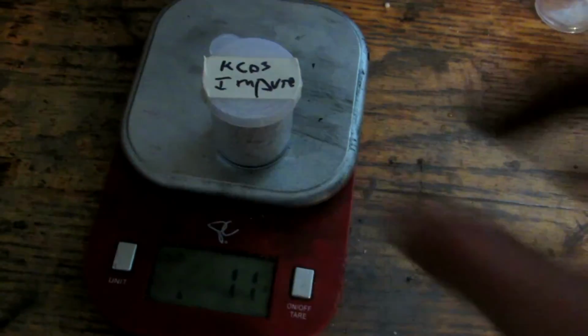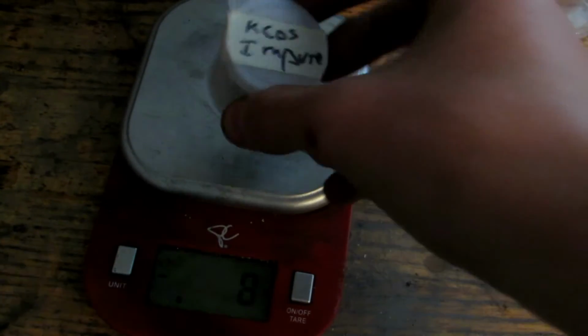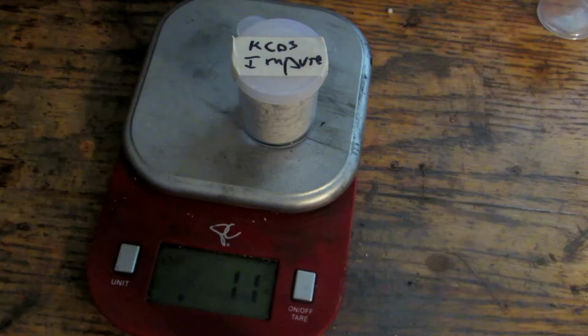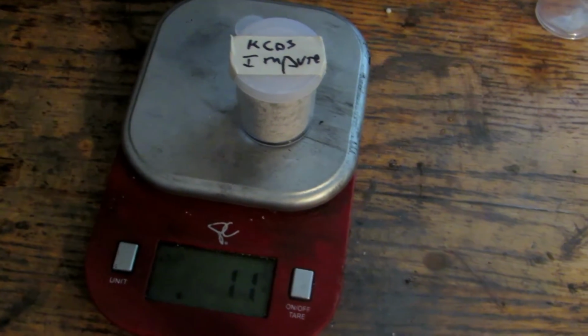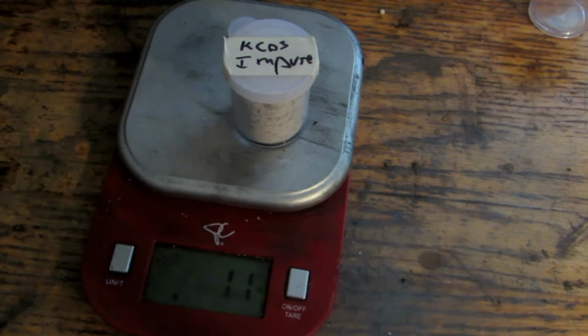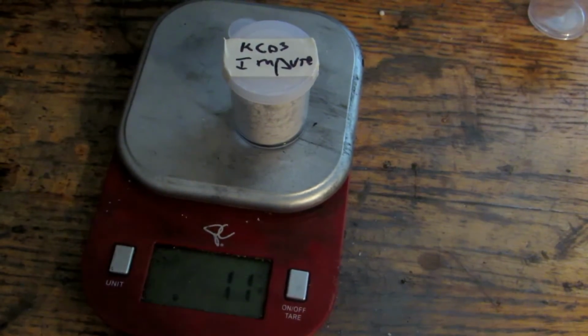So the first thing that we're going to have to do is take this 11-gram sample and bring it outside and put it on my brick, and then arc furnace it to very high temperatures, and we'll see what sort of reaction we get. So I'll meet you back when we're outside with my arc furnace.